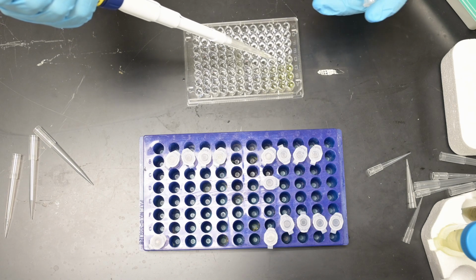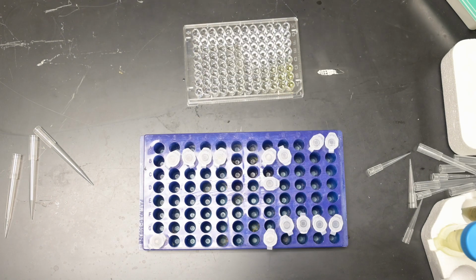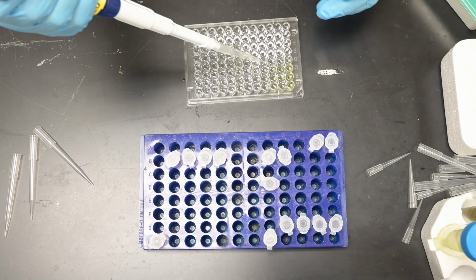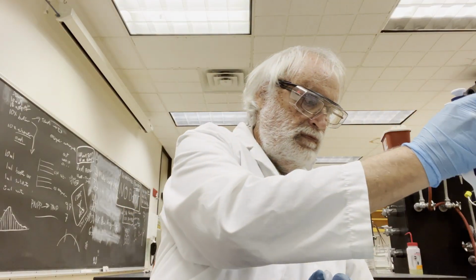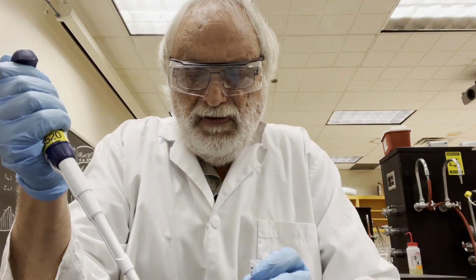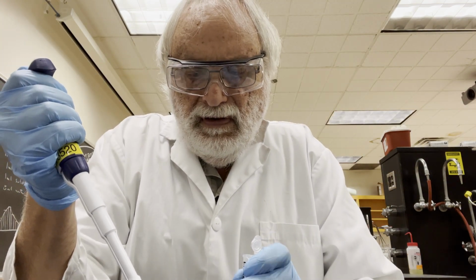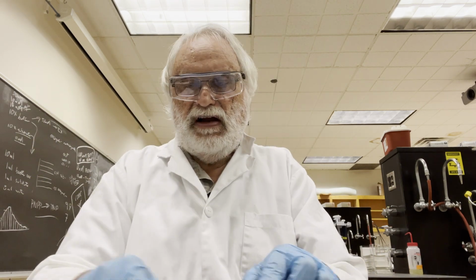In B is 10 millimolar. 2.5 millimolar in 4. 1.25 in 5, and there we have our standard curve and our hydrolysis.